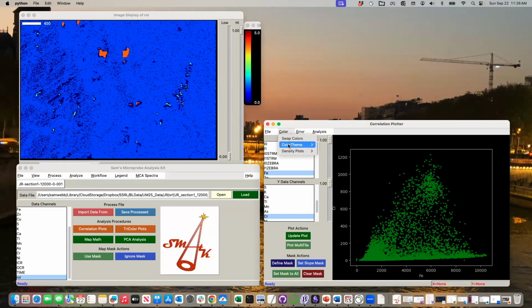And for color, we are going to go to cluster. And there you go. This works, as we'll do with clusters later on too, for any kind of color scheme here. You notice that we even picked off the exact color map for our colors here, so it's a nice, perfect correlation. If you changed your color map from jet to something else, it would also make those points the appropriate color map changes. So you can see the highlights of the different masks here, the big blue area there, and so on and so forth.